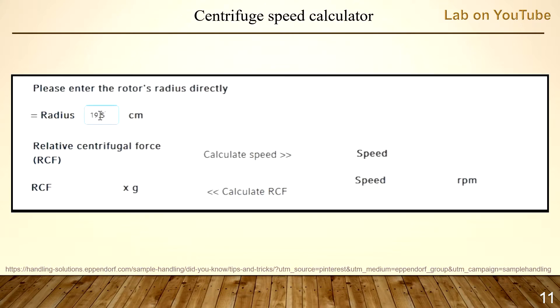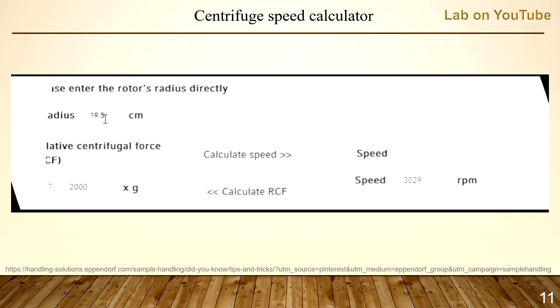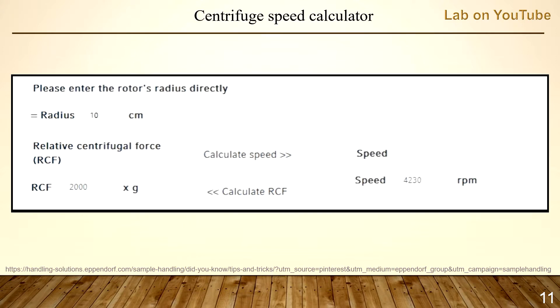The easiest way to calculate RPM is using a speed calculator — just plot your numbers and calculate speed. It's a good exercise to enter your centrifuge's radius and the RPM you are currently using to calculate the actual RCF. If you get an RCF less than 2000 G, please contact your lab, as we don't use less than 2000 G for general pathology testing. Note: the speed calculator is more accurate than the nomograph.